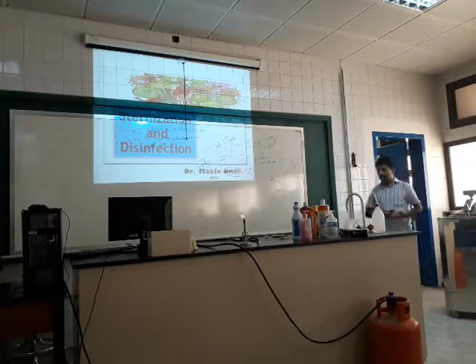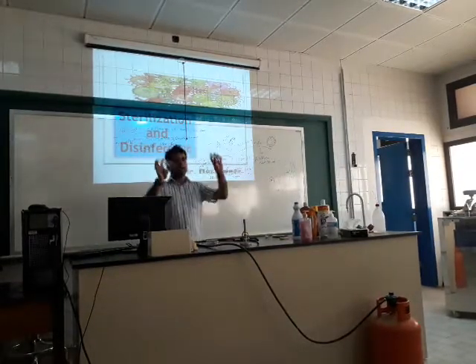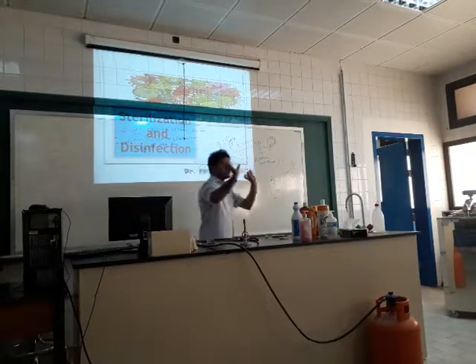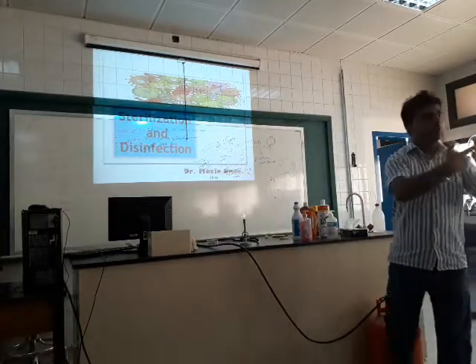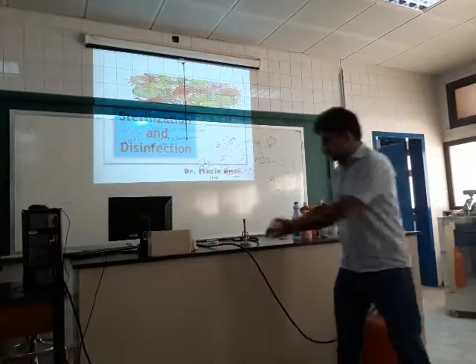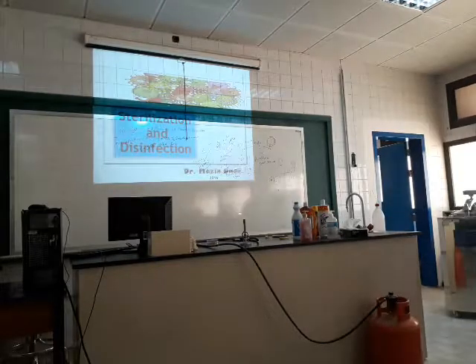And you have one more thing, culture and sensitivity. This is called the culture plate. Inside here, this red color is the media. If I put dust here, keep it like this, and this is the machine, called an incubation machine.